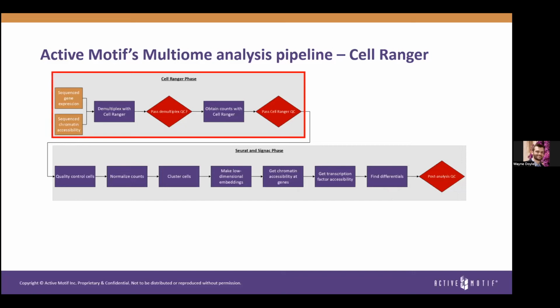So I'm not going to talk too much about the actual Cell Ranger steps. 10x Genomics offers a lot of very informative webinars about what the outputs of Cell Ranger are. They also offer events to meet with other people that are using the Cell Ranger software. So for this webinar, we're not going to touch upon Cell Ranger specifically, but instead focus on the second phase of the analysis that we do.